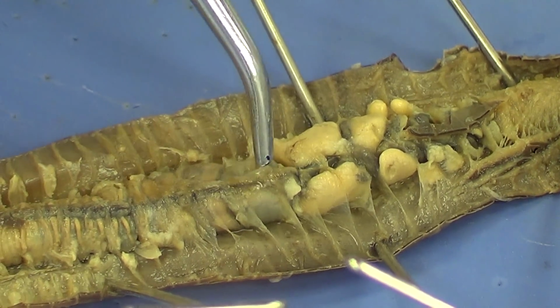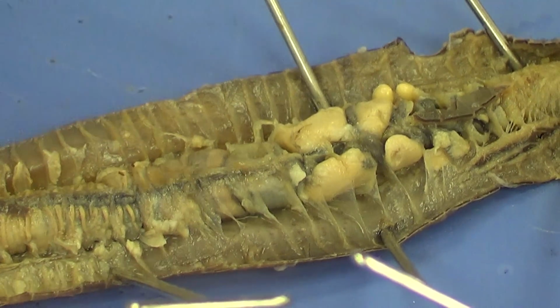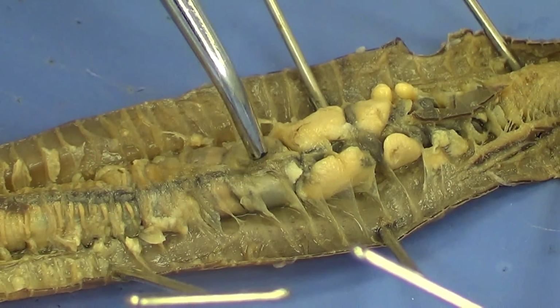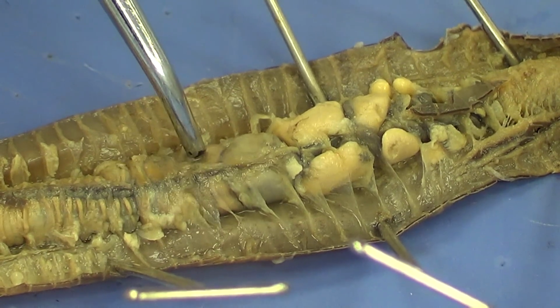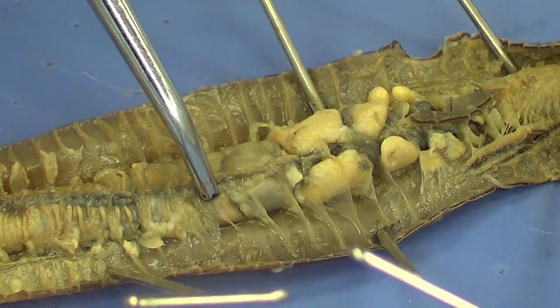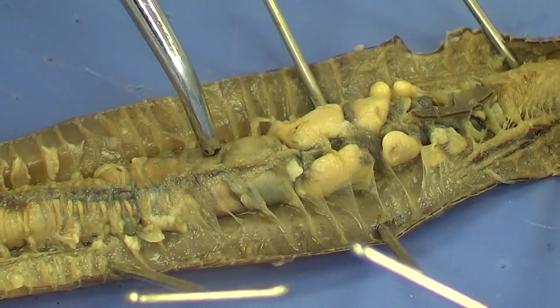And this should be very soft, very distensible, so that it can enlarge easily. If this was thick material, it would not be able to enlarge. That's going to be the crop. And then you have this structure right here. Notice how firm this is. Very muscular, very firm. This is going to be our gizzard, where the food gets ground up.